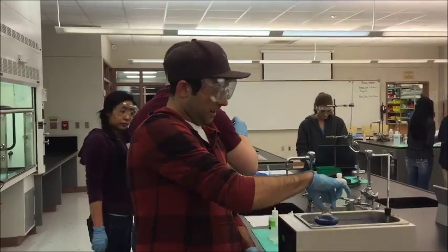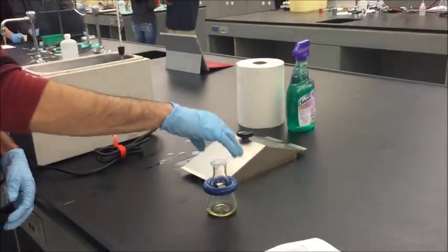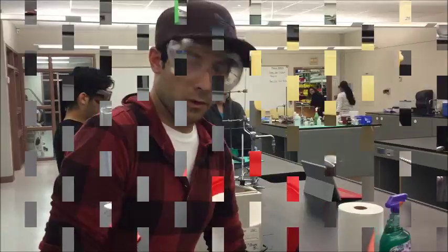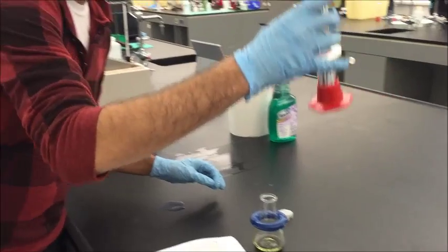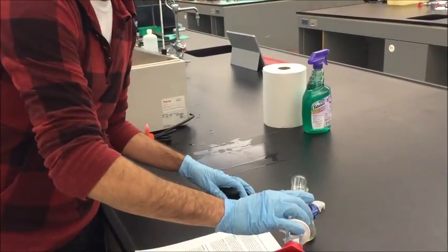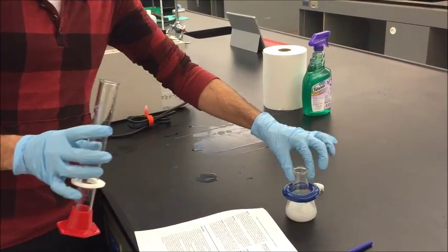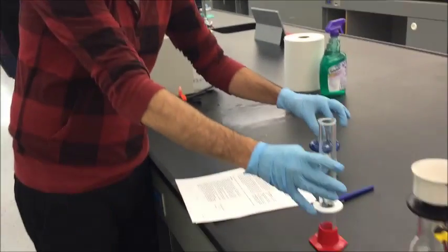At this point, we're going to take it out of the water bath, set it on the table, and let it cool down at room temperature before putting it into the ice bath. While it's sitting on the table, make sure you take off the parafilm and add 40 ml of water into the mixture, which will cause it to precipitate. Continue to stir at room temperature before putting it into the ice bath.